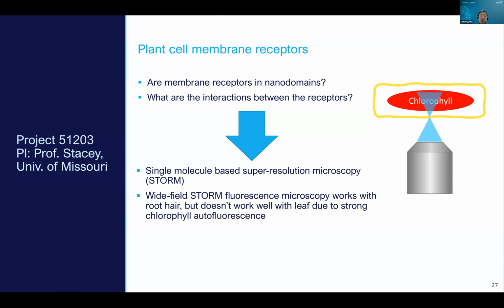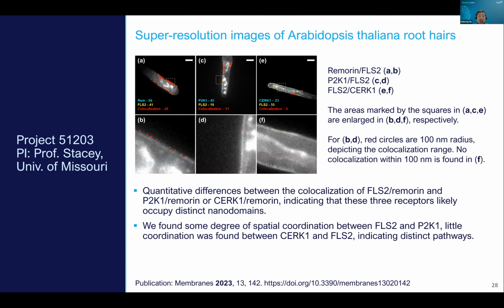So we couldn't do the work on a plant leaf; we had to do it on root hair. This is a super resolution image of a root hair.